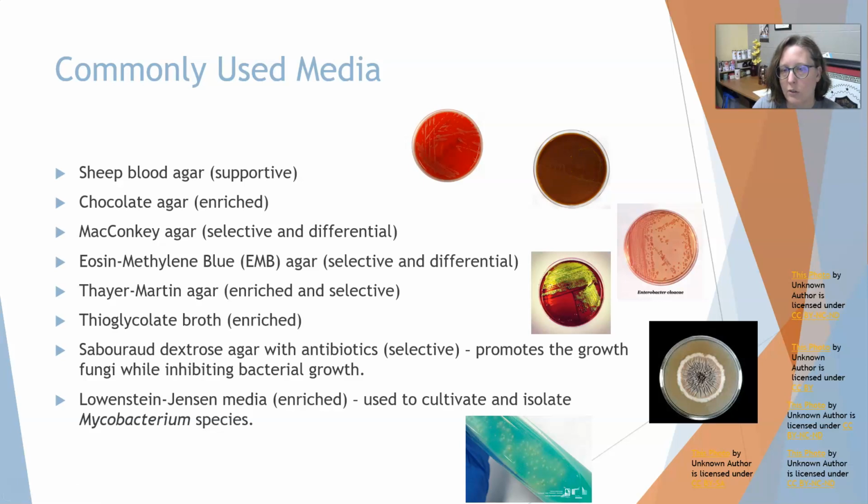Especially Neisseria gonorrhoeae and Neisseria meningitidis. Then we have thioglycolate broth. It is enriched. I don't have a picture of it here. Just portray a tube that looks like chicken broth that's pretty clear. That would be thioglycolate broth.